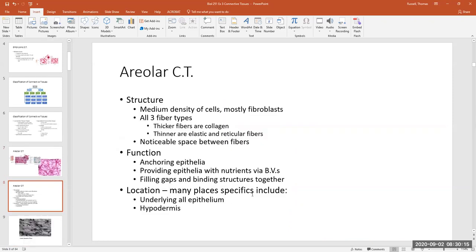These tissues contain the most fibroblasts because those fibroblasts are producing all of those fibers. The thickest fibers in the connective tissue are the collagen fibers, then the thinner ones are elastic and reticular fibers. The elastic fibers are typically a little bit longer, and the reticular fibers have more branching patterns.